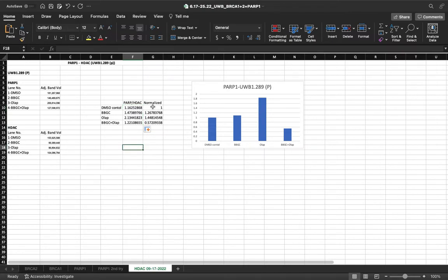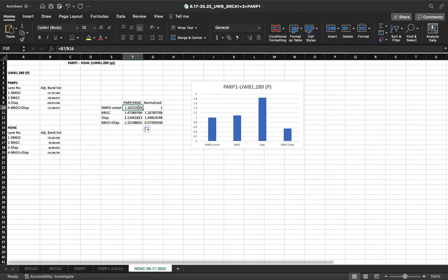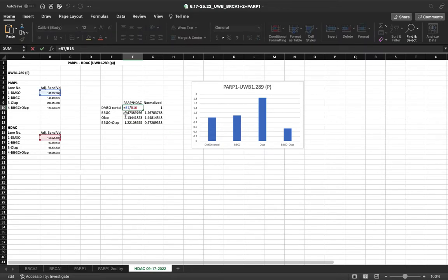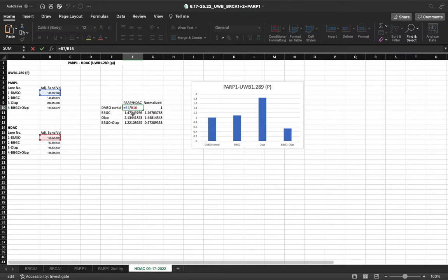We need to normalize the data. In order to normalize the data, we're going to use our DMSO control. And we're going to divide each PARP over HDAC, or experimental over loading control, just as such.